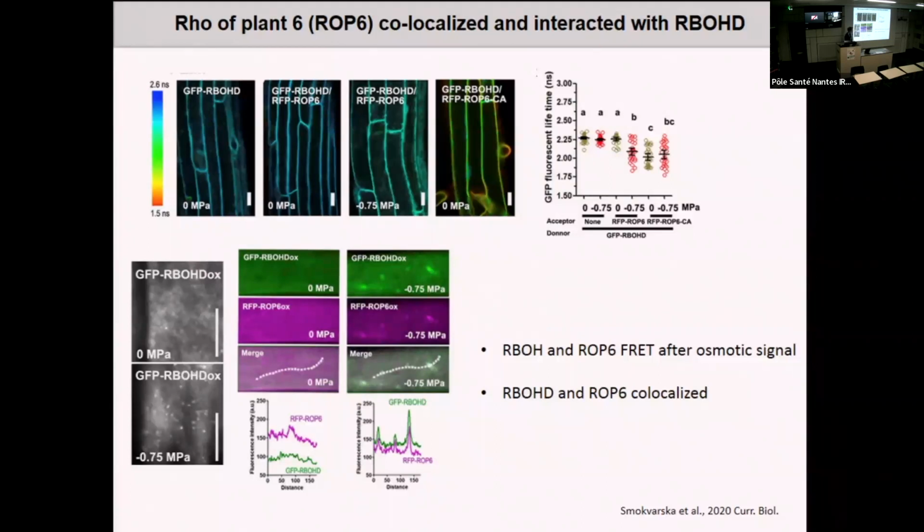The other information that we found is that the NADPH oxidase is also making clusters after stimulation. And this is probably not the best piece of data ever, but we tried to do two-color imaging, and it seems that they might actually be associated in the same structures.